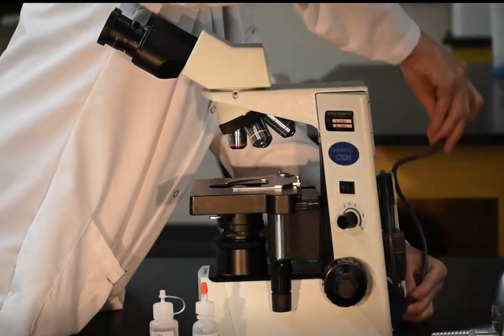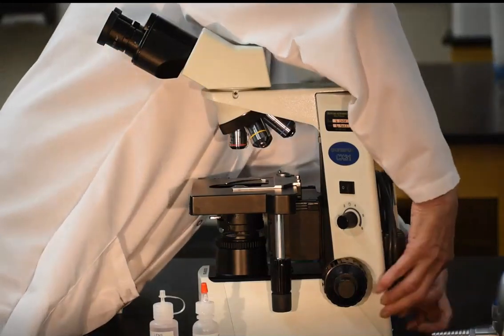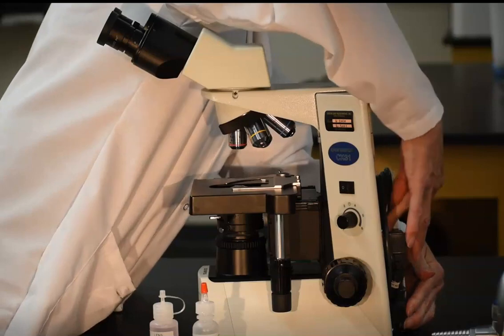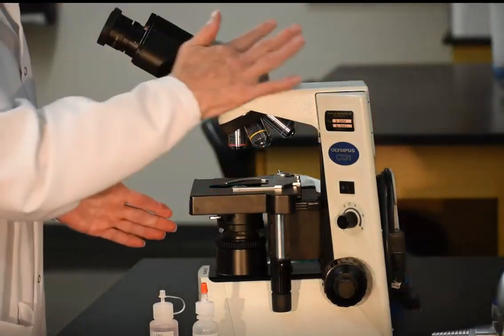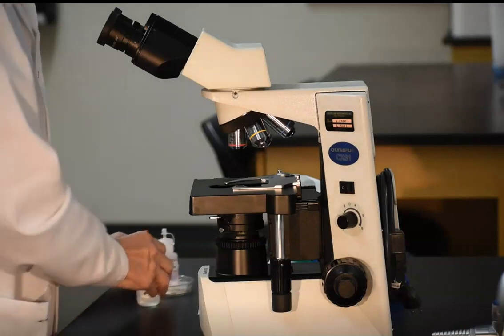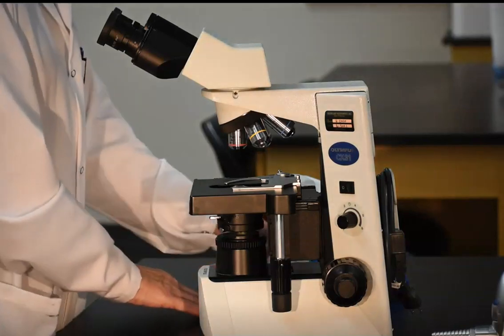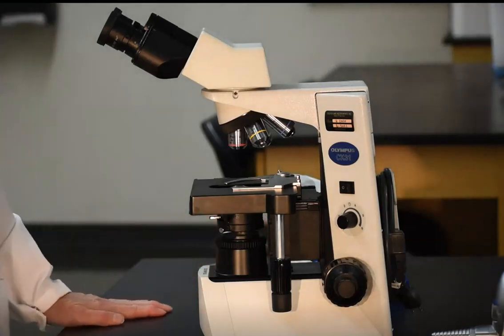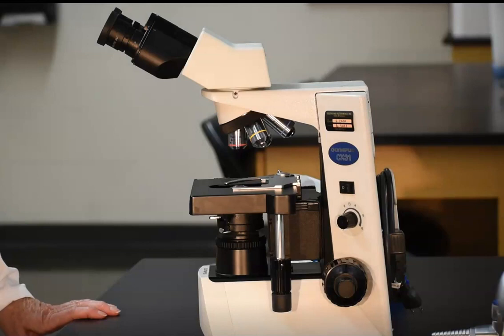Check. There should not be visible oil on the stage, nor should the ocular lenses look oily or have any trace of makeup. The microscope body should be free of marks or random specks of dye or ink. If the microscope has any of these, please clean them off. Ask your instructor for help. Do not resort to harsh chemicals to clean this instrument.